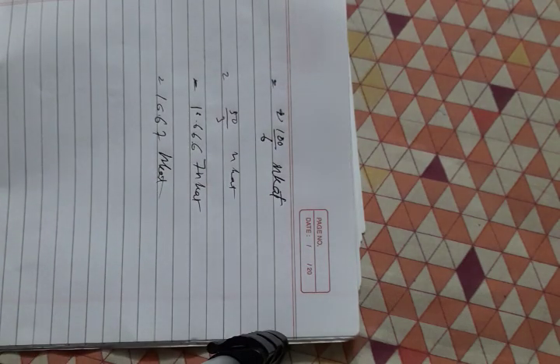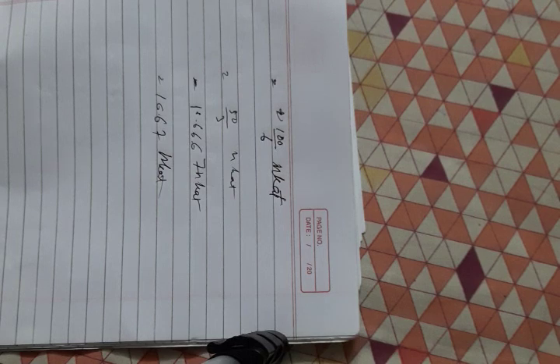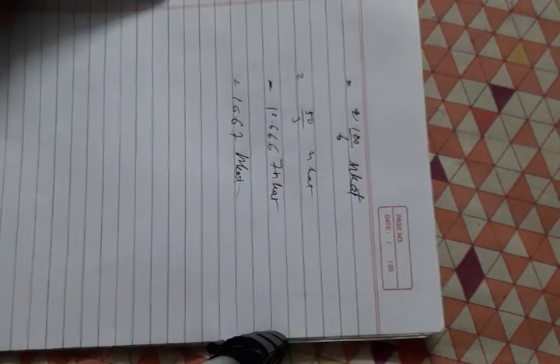And then, now the question is how we can calculate the activity of the enzyme. I said that if we calculate the concentration of the maltose, then we can do it, right?